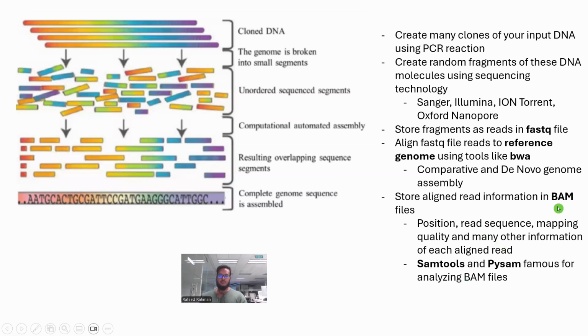And if you want to handle BAM file, if you want to analyze BAM file, two famous tools are available now. One is SAMtools and one is a Python-based tool, which is PySam. So you can check them out.